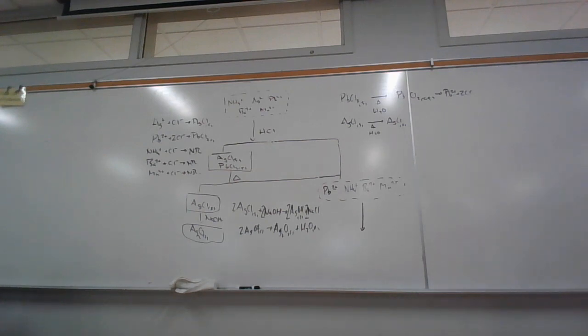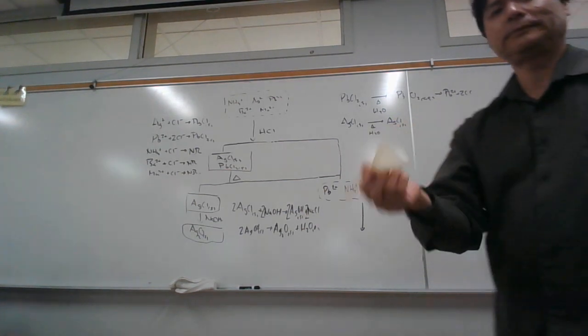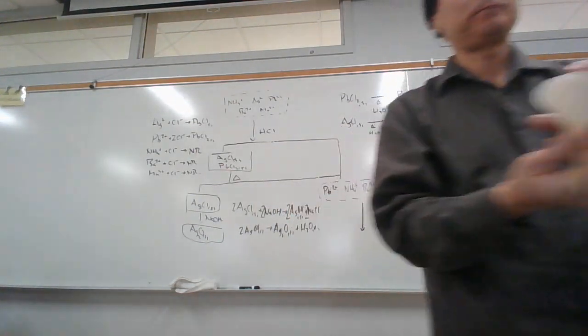And I just put the filter paper in here, but it doesn't want to sit in there. I just get a little bit of DI water. Make sure that it's not tap water, DI water. And then just wet the filter paper so that it adheres to the funnel. This is kind of what you do with the red litmus. It's going to adhere to the bottom of the watch glass here. And so this is the filter paper.